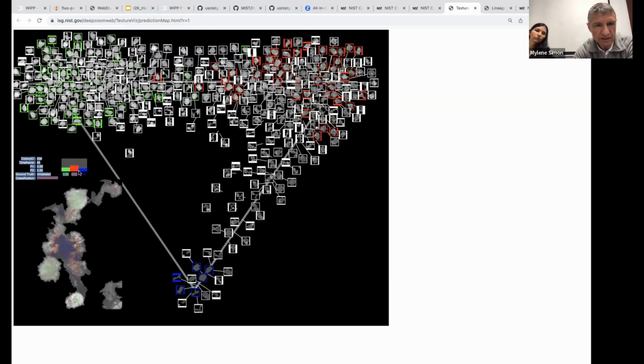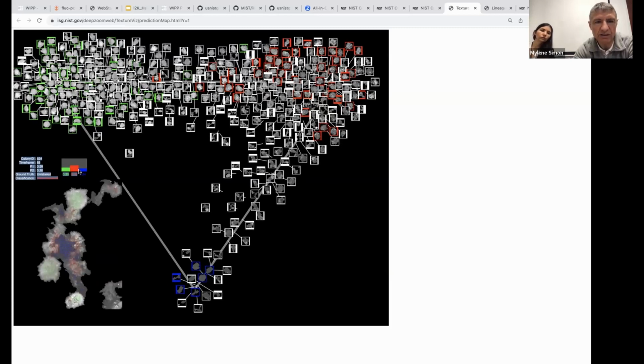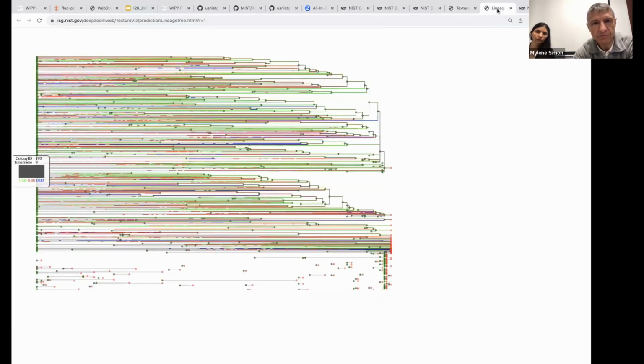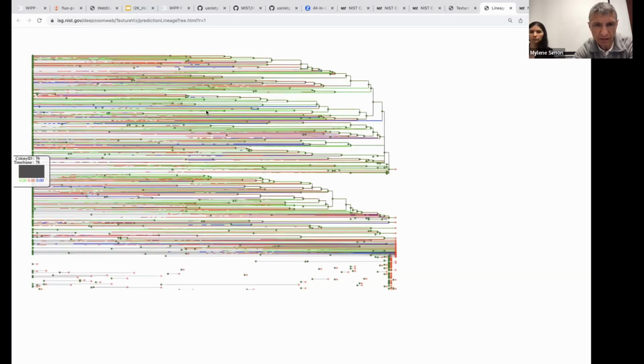You can also see here the probability that each colony is homogeneous, heterogeneous, or dark. Eventually, when it goes to production, you would like to have some kind of understanding over time. So that was one time point before, but now you are looking at how each colony over time was either homogeneous, or switching between heterogeneous and homogeneous, or dark. And you can zoom in.